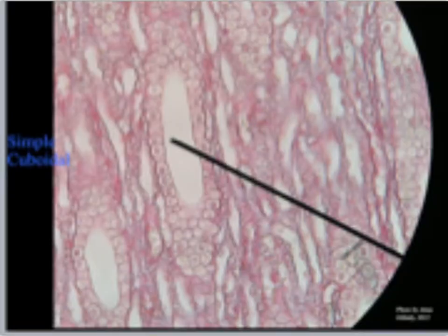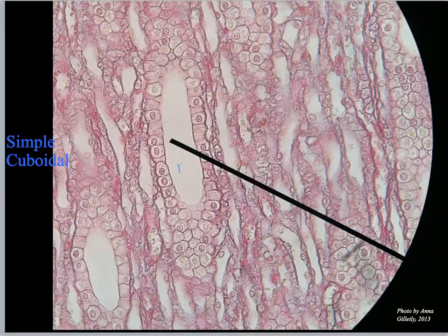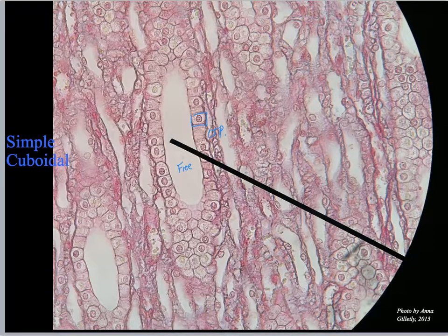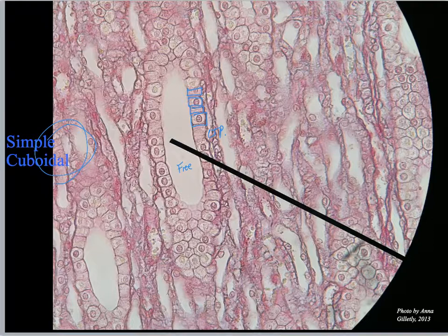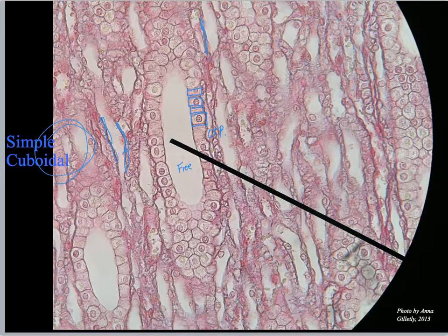Now we're looking at a kidney tubule. I have my free edge here, I have my connective tissue on the basal layer. Here is simple cuboidal — one row of cube-shaped cells — so this is simple cuboidal epithelium. And you can also see nicely right here simple squamous right there. So I'm seeing both types of tissue on this slide, and that is normal.